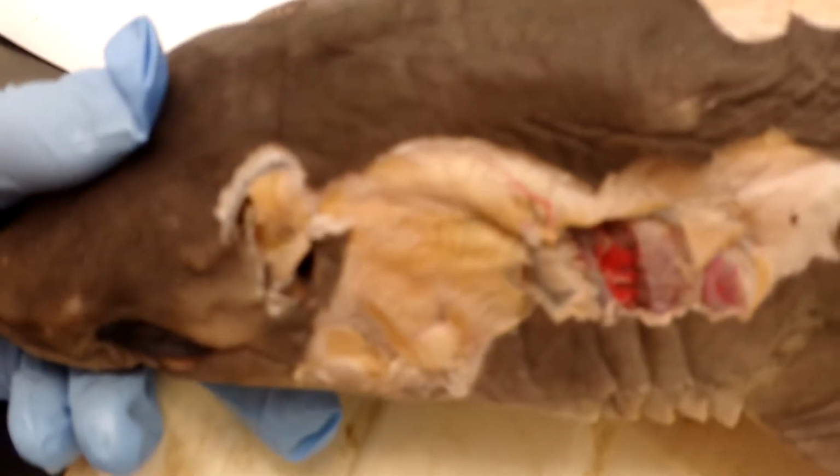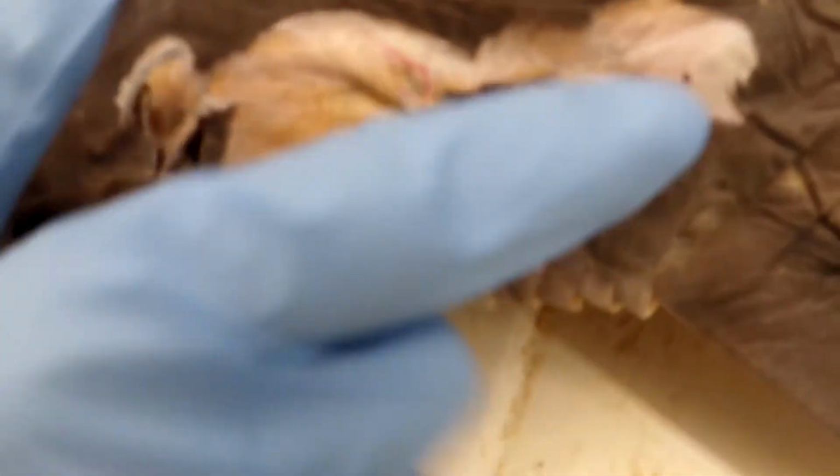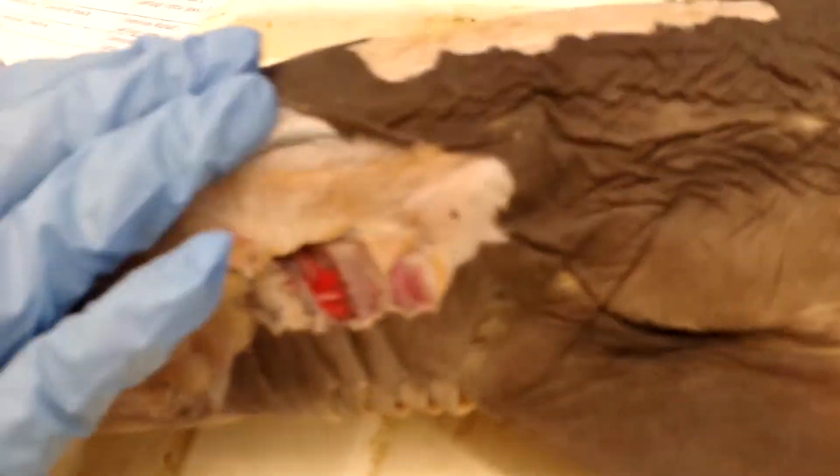The next muscle is the dorsal constrictors, which are found right up here and more like up here underneath this flap of skin up here.